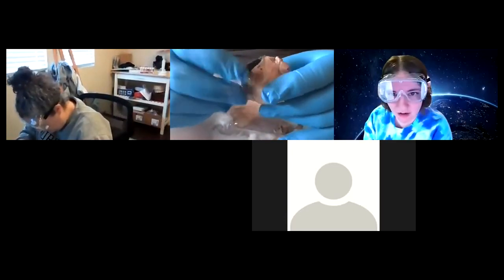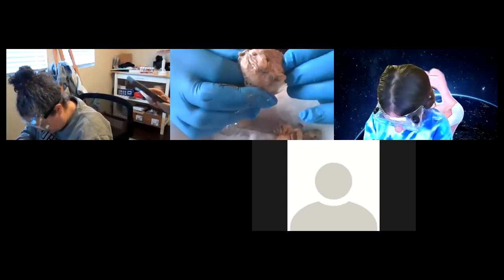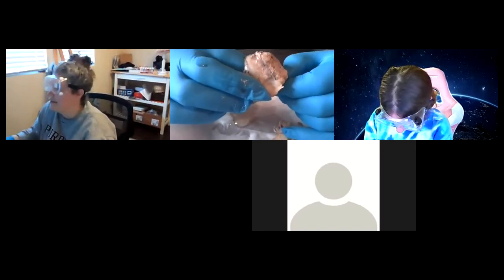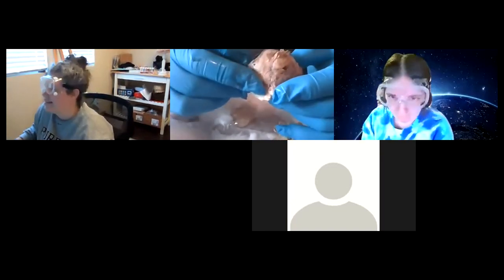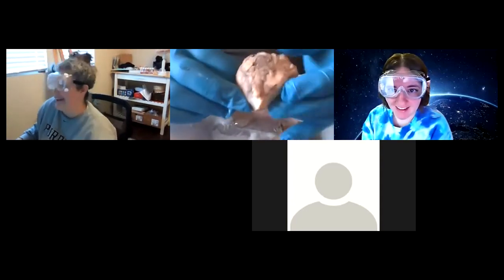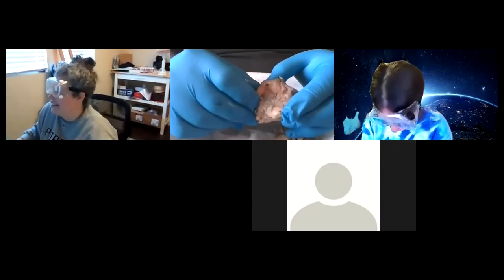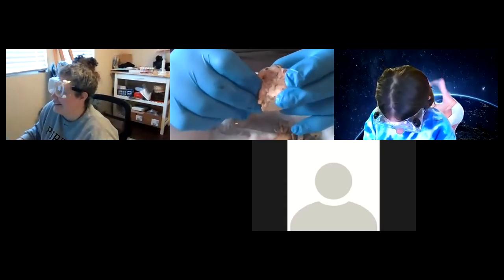It's kind of tough though. The sclera is really tough. That's going to be the second hard part — when we cut through the sclera. Usually in lab we're doing this for like two hours, and now we're doing this in a 40-minute Zoom session.